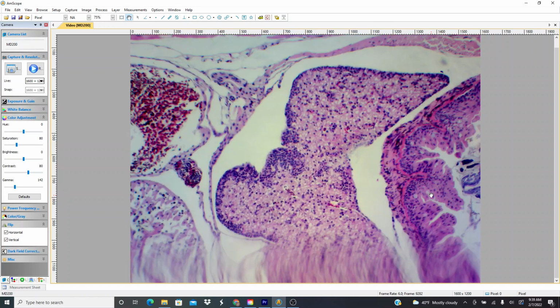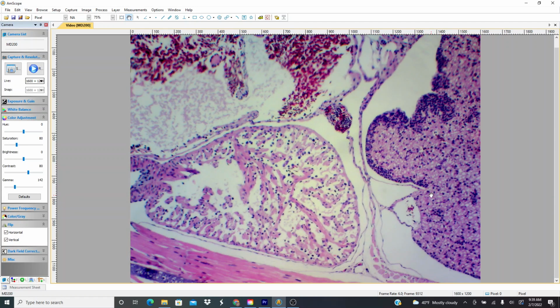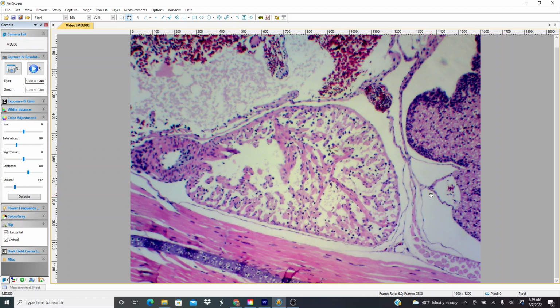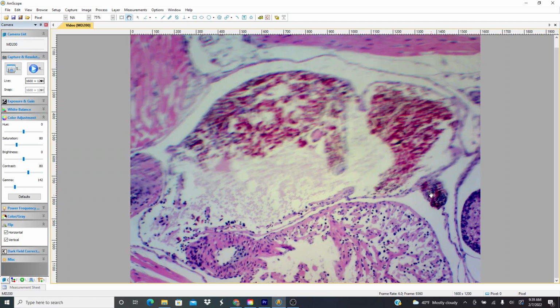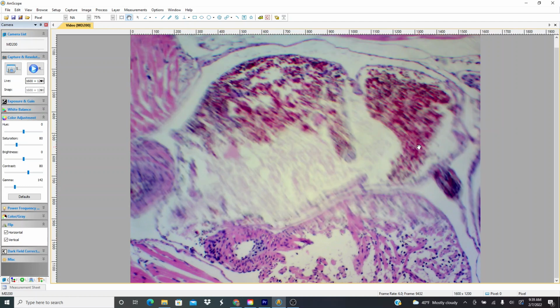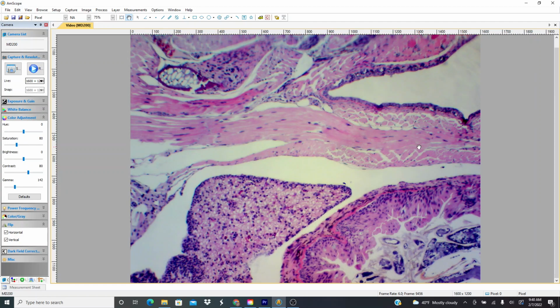Let's see. I sure would like to know what this thing is. But I don't know. But this, I'm almost certain, is a heart. And I don't see any big vessel coming off of it unless this is coming off the top. And could this be the aorta or what? I don't know. The aorta probably wouldn't be this big compared to the heart. I don't even know if they have an aorta, but I just don't know.